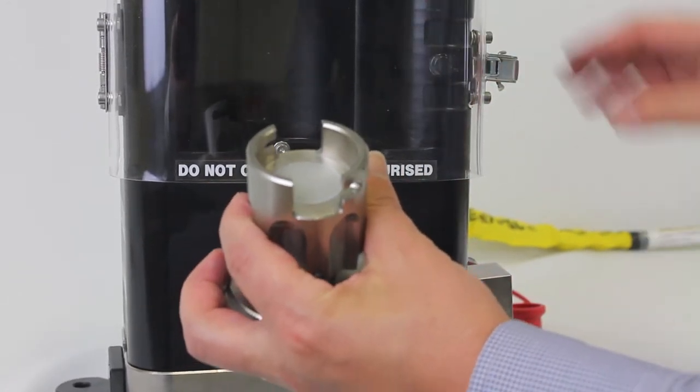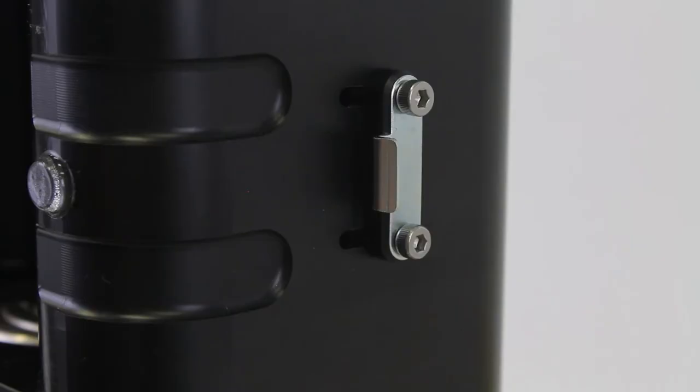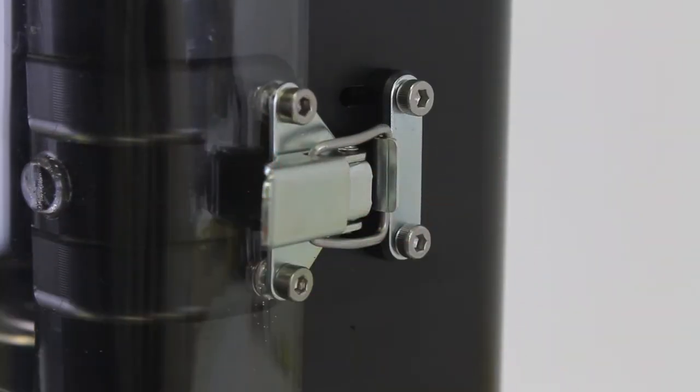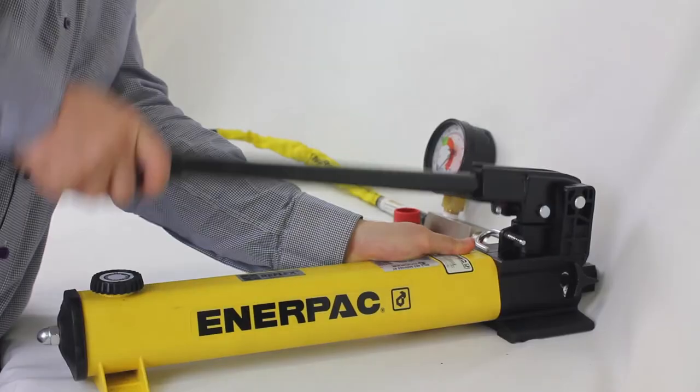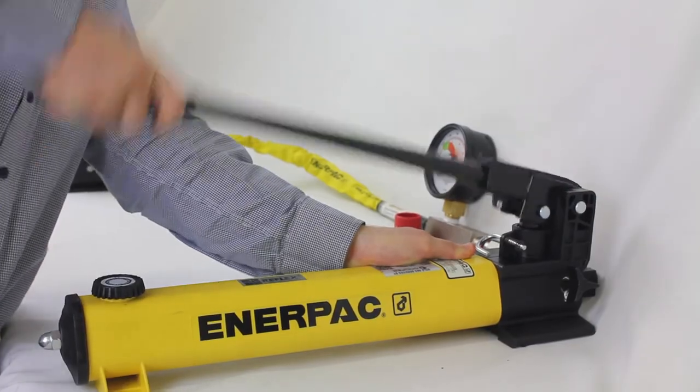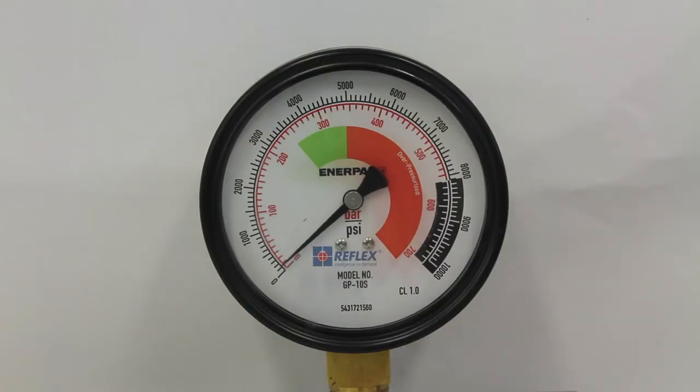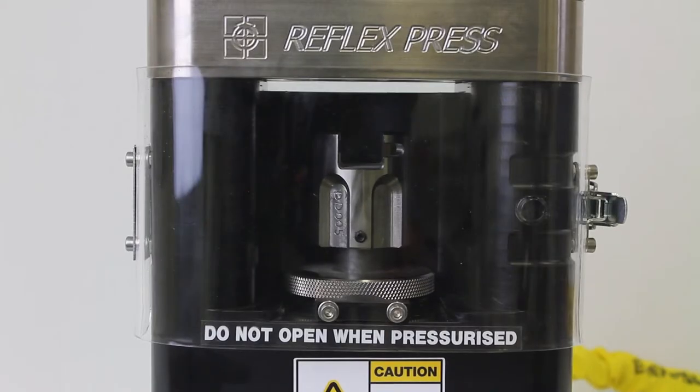Close and latch the door. Close the relief valve and begin pumping. The die will rise against the top of the press and the sample will be progressively pressed out of the die.